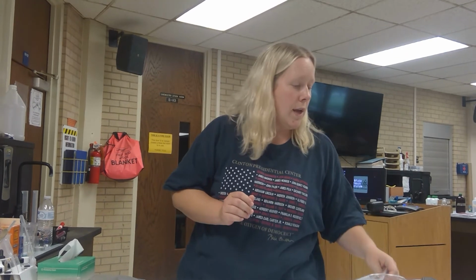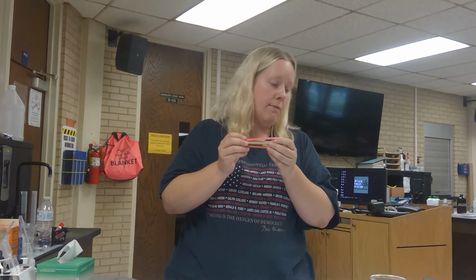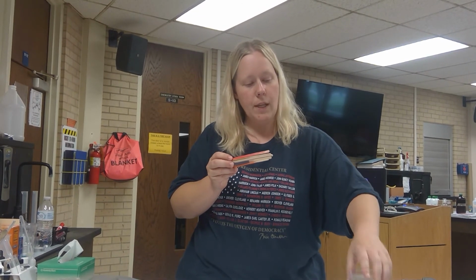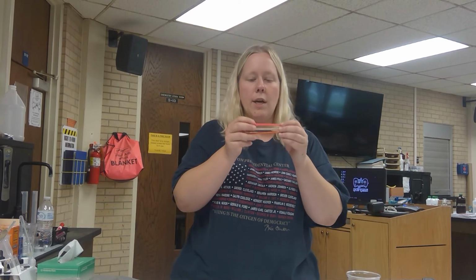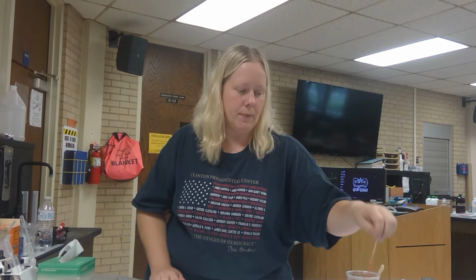All right. So the next part of this, we will continue on with the flame testing. For the next part, I need to fill my cup up with water here. I'm going to cut these sticks into 4 separate pieces, and then I'm going to put them in water and let them sit. The idea is that by letting them sit in water, when I look at the flame, the wood is not a factor. So you're just burning the chemical and not the wood portion.